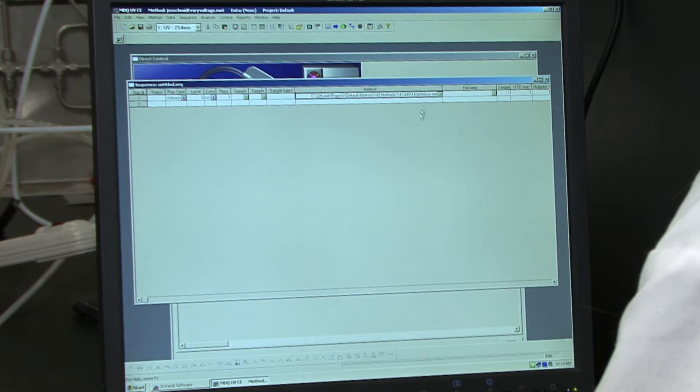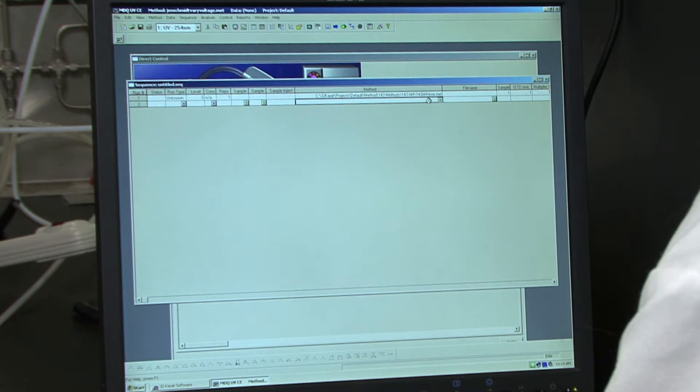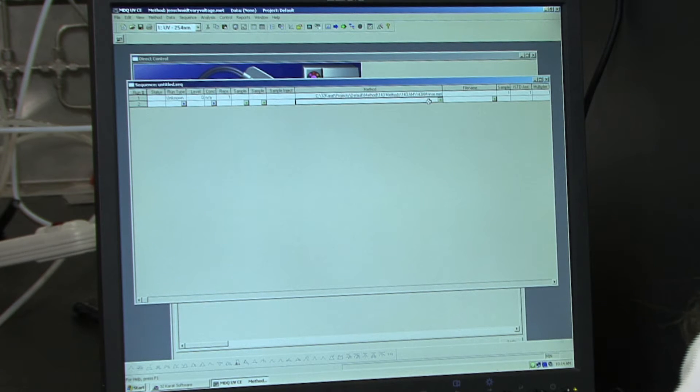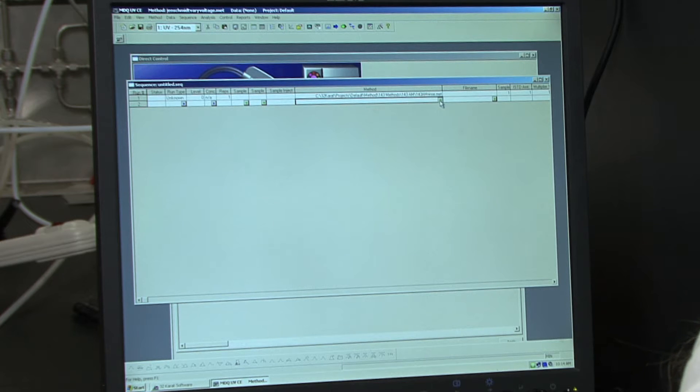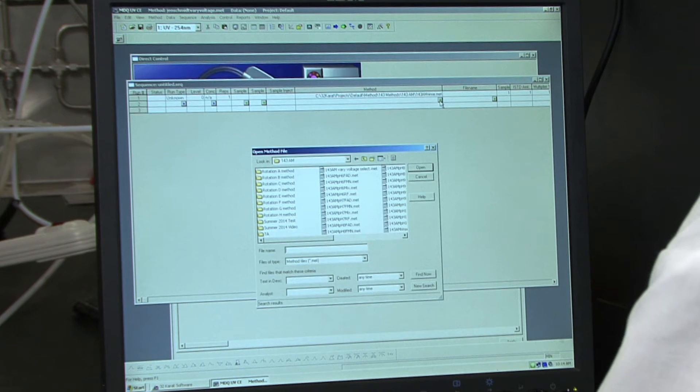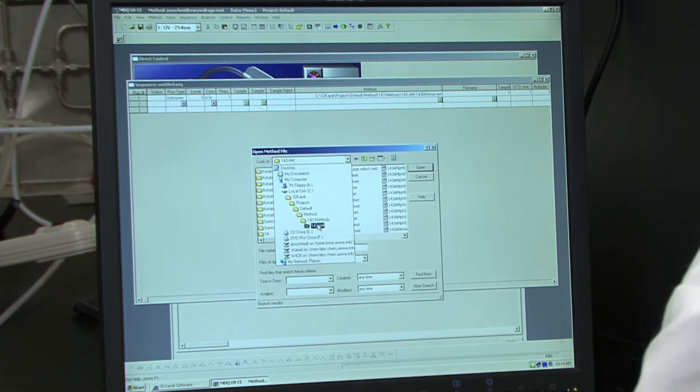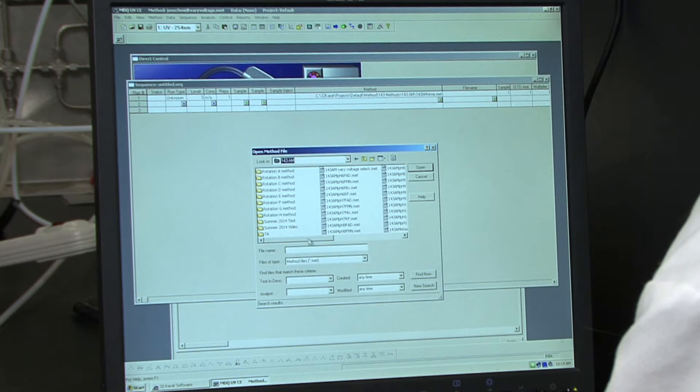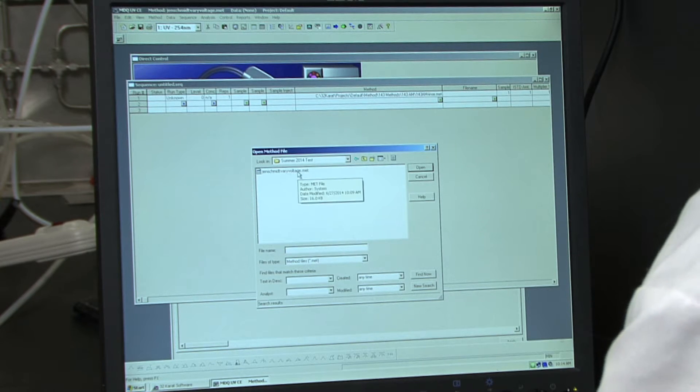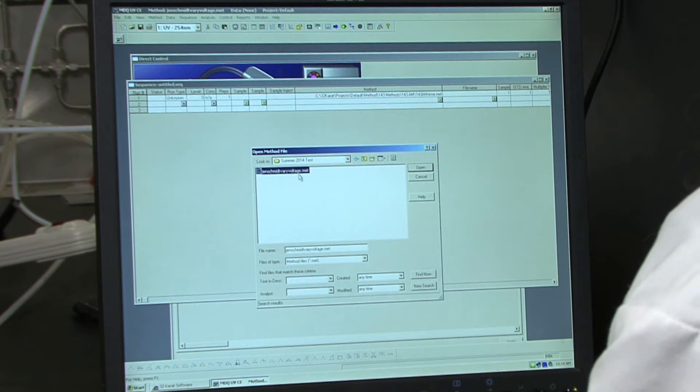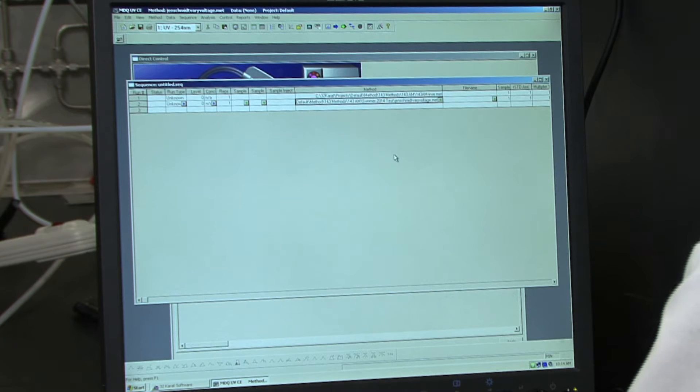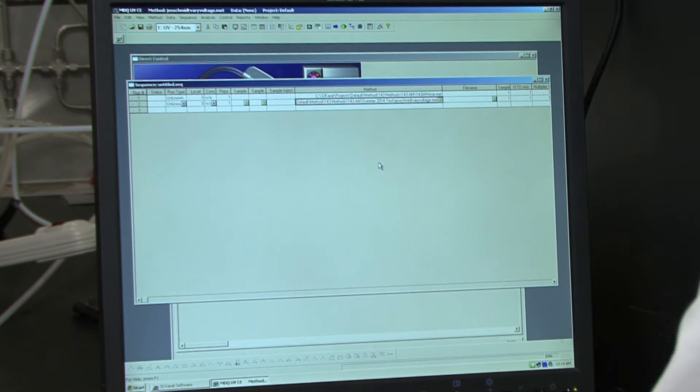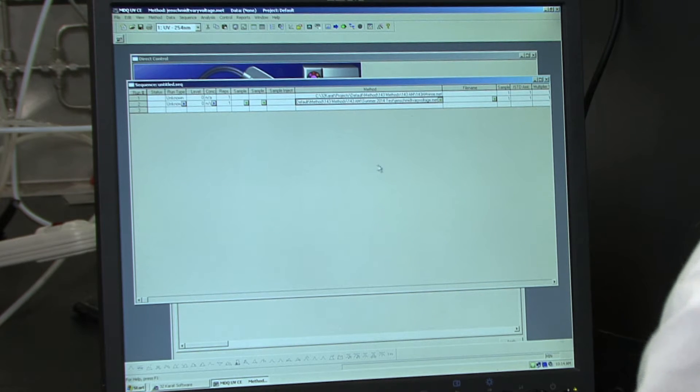Now we want to load the method we created for our variable voltage. So to do that, you just again click on the green diamond and click on the method I created. And then last, you want to load the rinse method again.